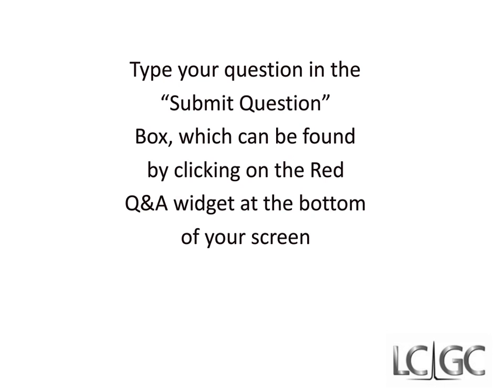Well, HILIC is, in a sense, the opposite of what we're used to doing in laboratories in reverse phase. I think HILIC has its applications for specific compounds. Glucuronides, I think, have a lot of application. Polar compounds, if you're looking to do some sort of separation, you're going to obviously have maybe longer run times. But with respect to the characteristics of the compounds, then you're going to be looking at your gradient times and the solvents that you choose.